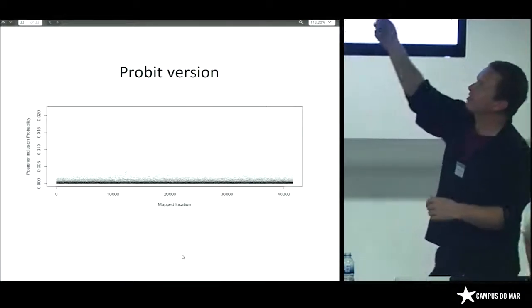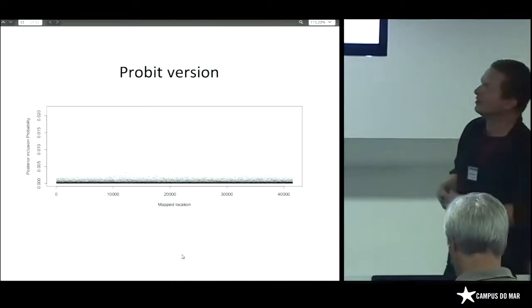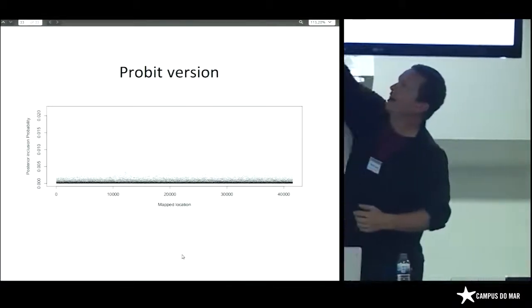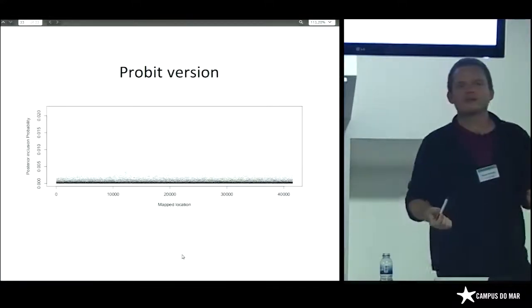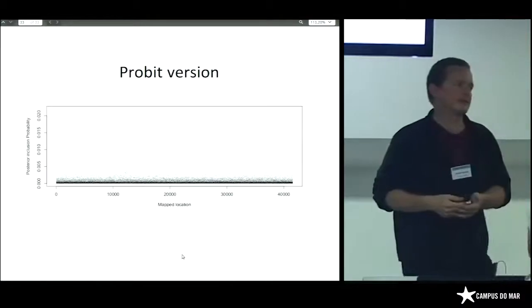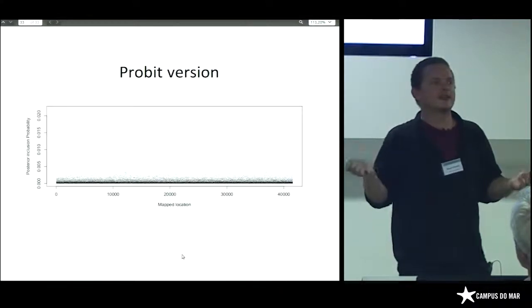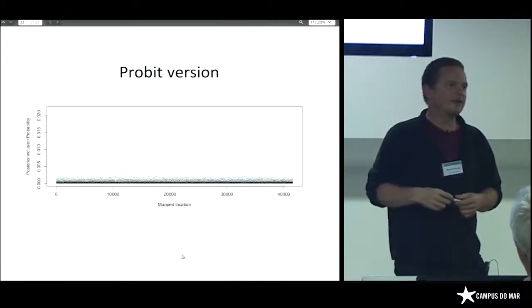And this is the posterior inclusion probability when we run the correct model for this data. And you can see that there's really no pattern there, and especially if you look at actually what these inclusion probabilities are, it's basically saying every SNP is less than 2% likely to be included in any one model. So we do not have an association in this trimmed down data set. But then again, we only had 2 million reads spread across 100 individuals, so we just didn't have any power at all.